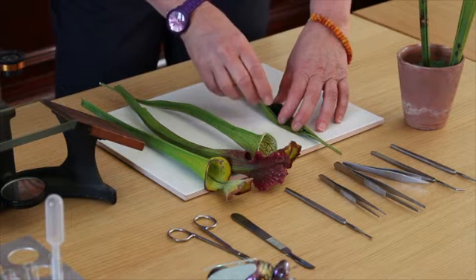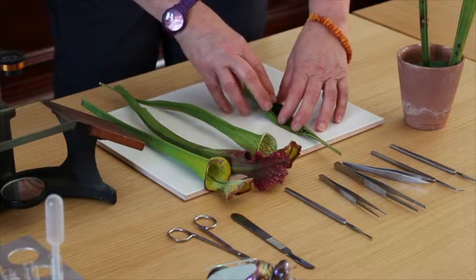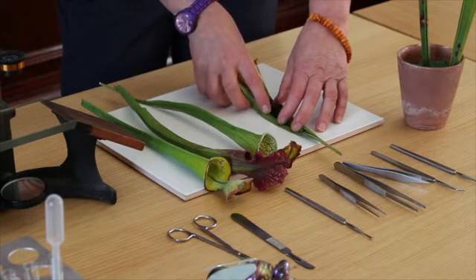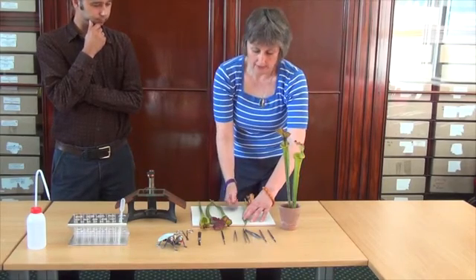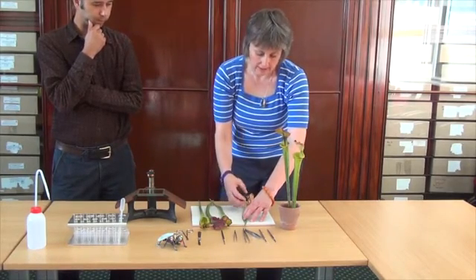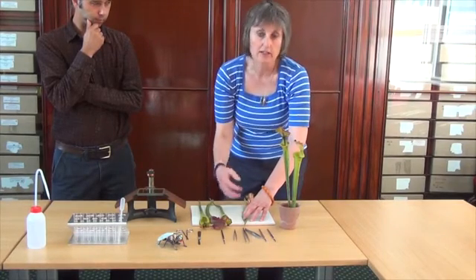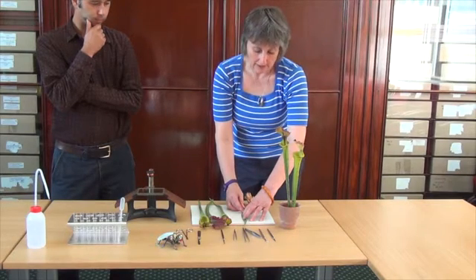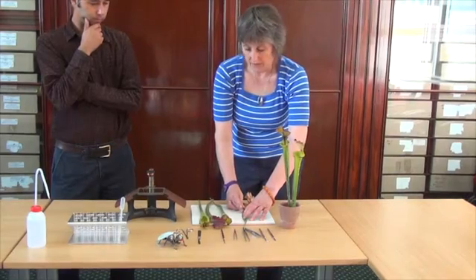The plant uses the protein in the body to replace nitrogen that's not in the environment where they naturally live. That's why these plants have adapted in this way — they've modified their leaves to make traps for insects, because where they naturally occur, the nitrogen is washed away and they need nitrogen as part of their growth cycle.